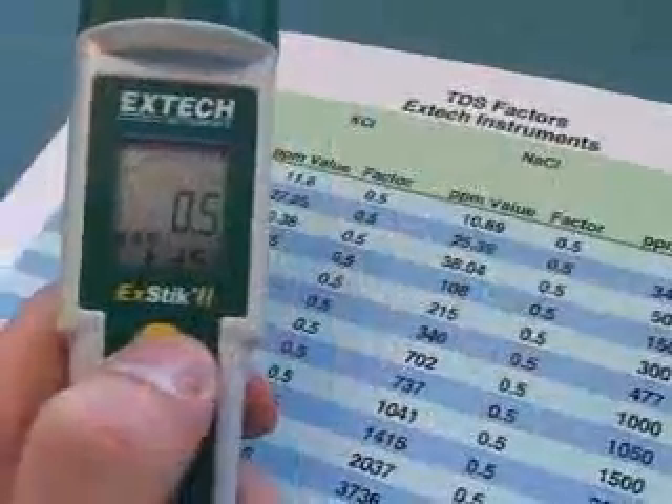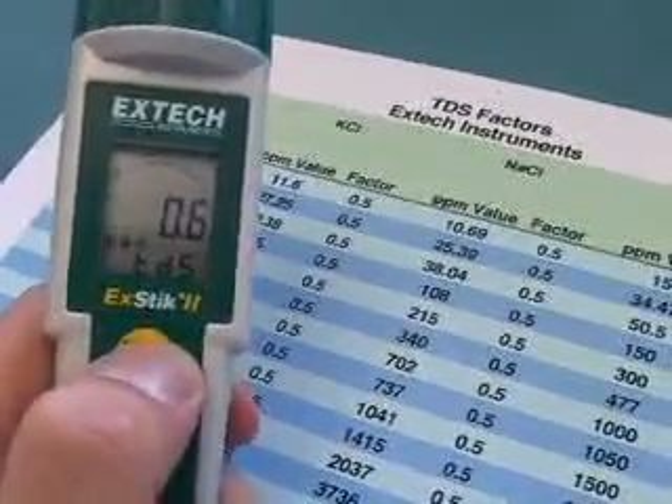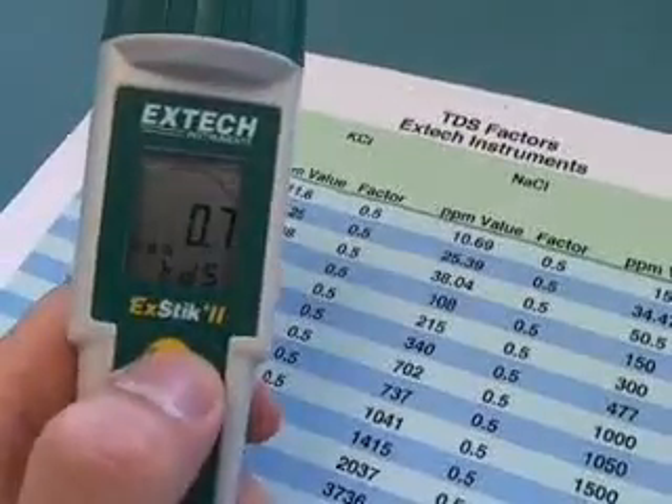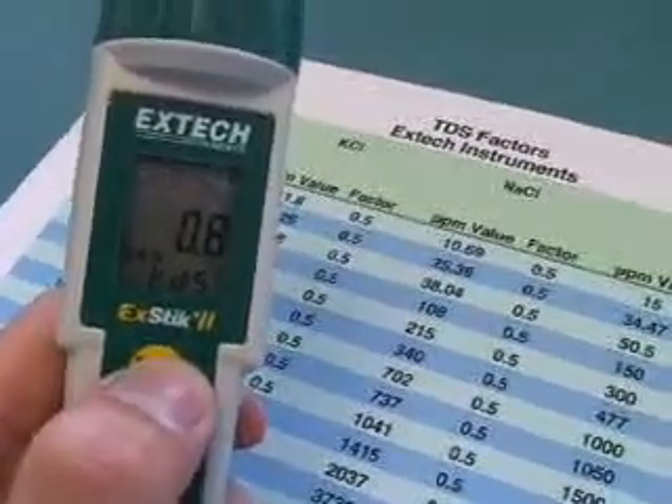An adjustable conductivity to TDS ratio allows you to select from 0.4 to 1.0 for precise calculation, while a fixed 0.5 ratio is pre-programmed for salinity.